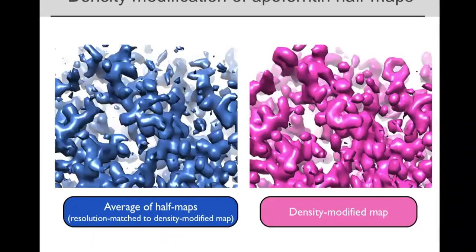And we have a sequence file. And we have information that our map has some symmetry. This particular map, human apoferritin, has octahedral symmetry, with 24 identical subunits. And so we have a little tool to find that symmetry so that in the model building process, you don't have to build 24 of them, you only have to build one. So let's do that first.